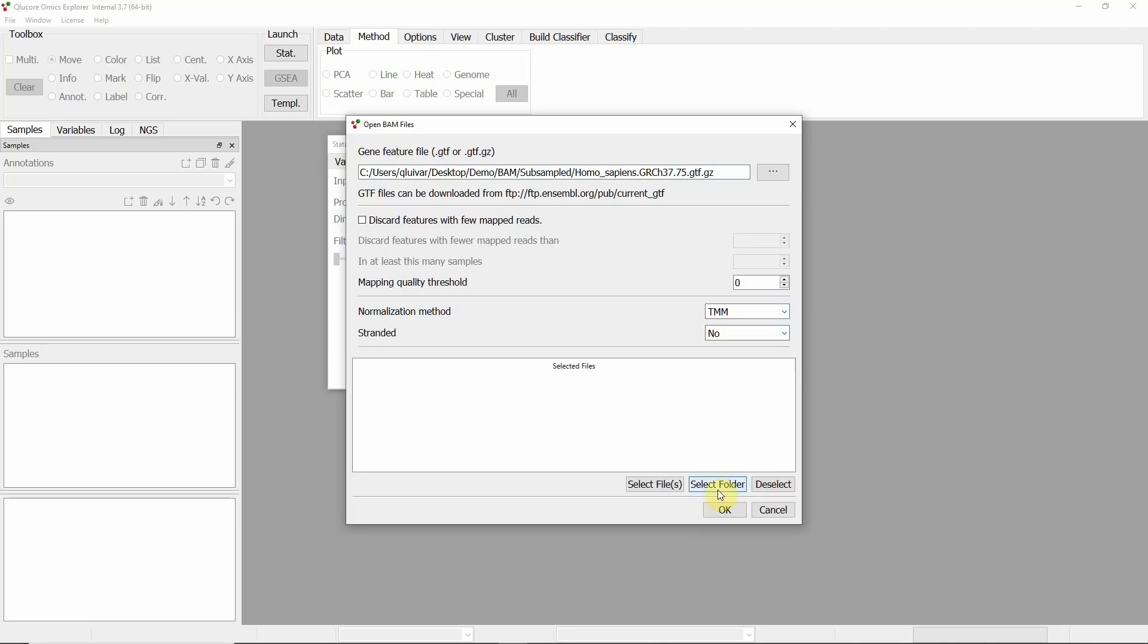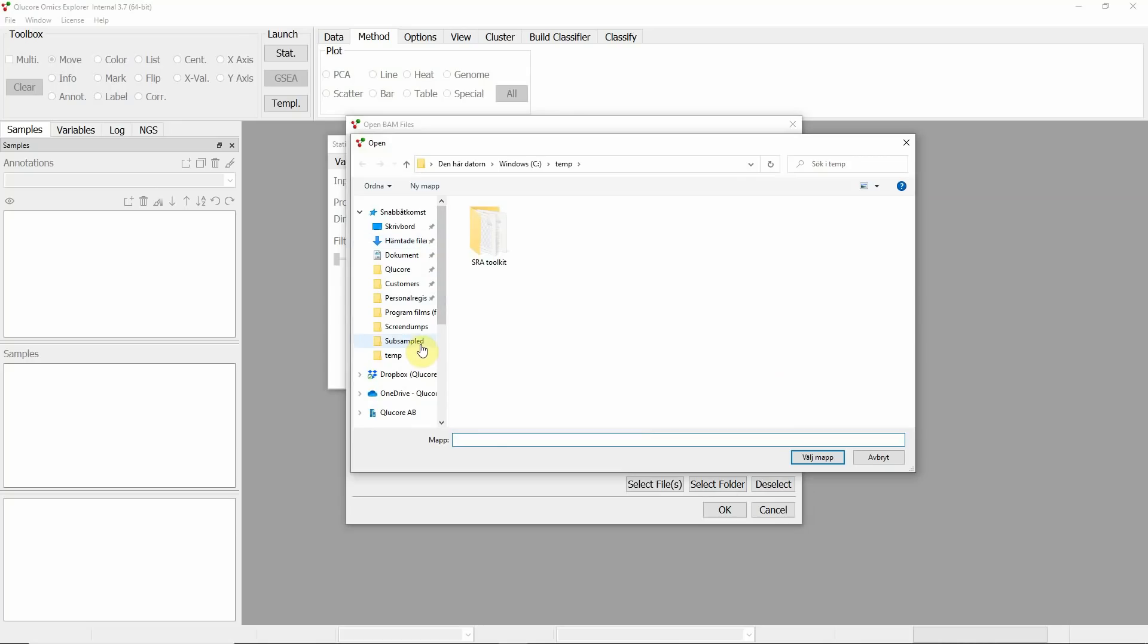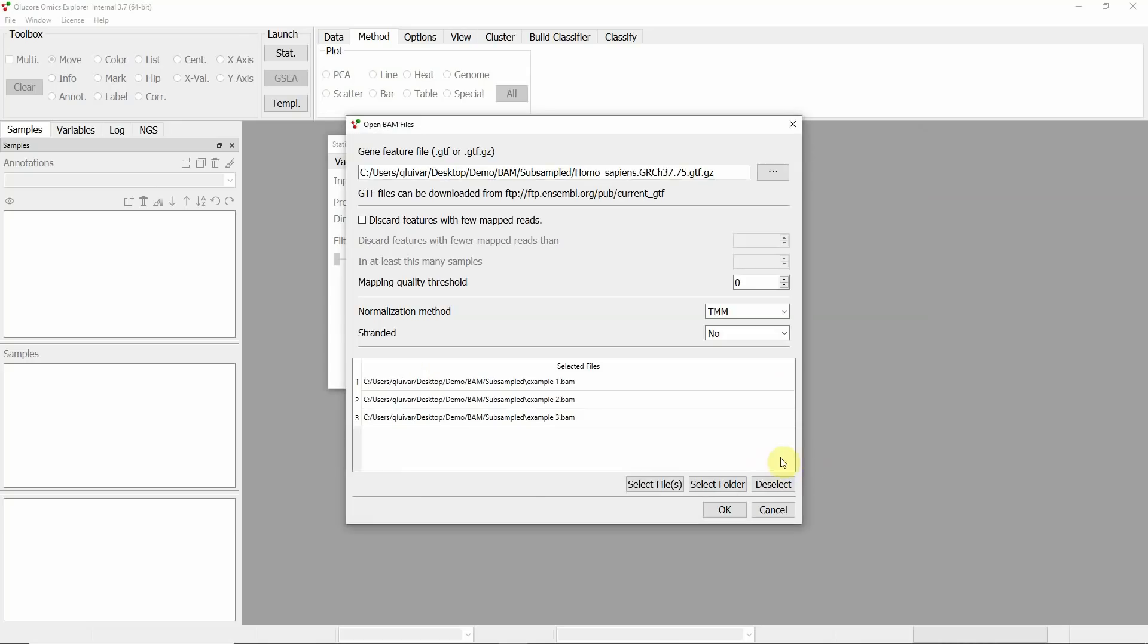If all samples are in one folder, you simply select that folder and all the BAM files in the folder are listed. Individual files can then be deselected or added.